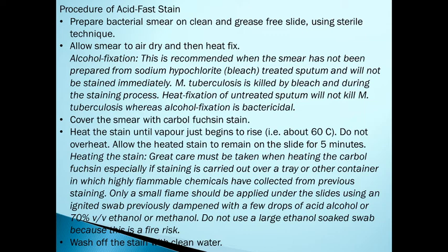Then cover the smear with carbol fuchsin stain. Heat the stain until the vapor just begins to rise. As I told you, heat is used as the accentuator. Do not overheat. Allow the heated stain to remain on the slide for 5 minutes.